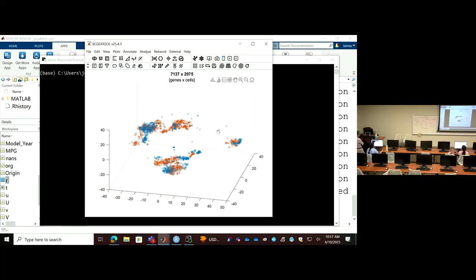Yeah. And then I ran Harmony through the... then use this. But then I did this part. I guess I didn't separate the batches, so I didn't do it properly. You can say no for now. Yeah, do that again. You already did it once, but you can run that again to make them even closer to each other.